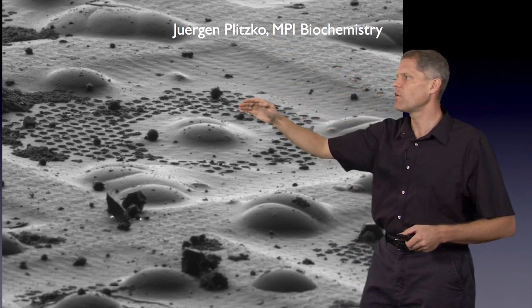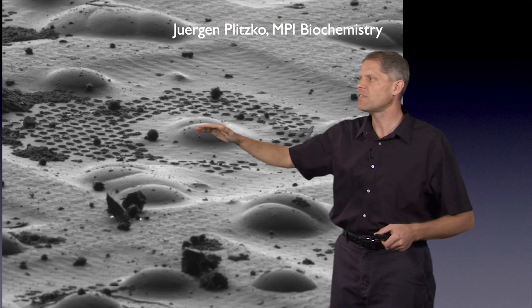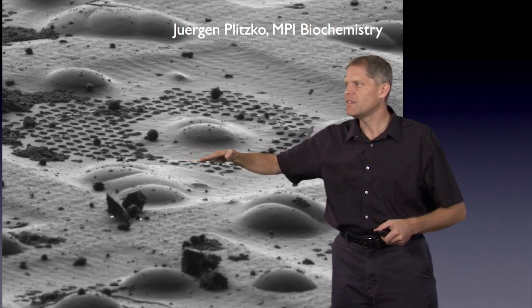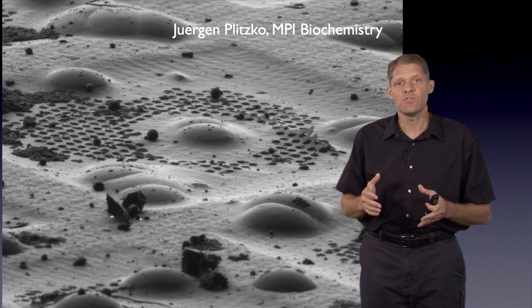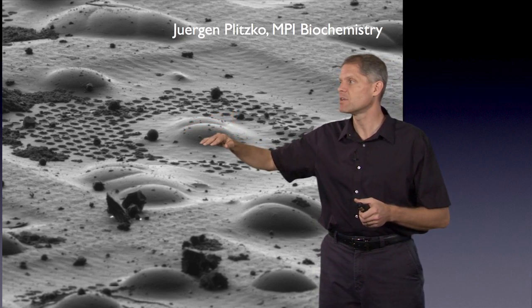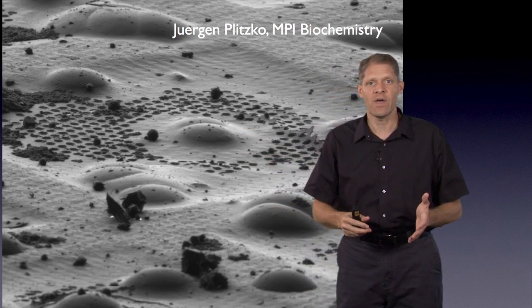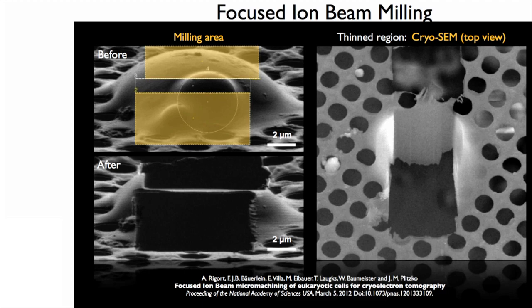And so over these quantifoil holes, a mammalian cell has grown, and the lump in the middle is the nucleus. But we can see that this cell type flattens out, so its periphery is very thin. And in these regions, it can be directly plunge frozen and imaged. But what if we want to view something inside the thicker regions of the cell that here appear as a lump? We can't do it directly because the electrons will all be scattered away if we try to image directly through that thick material. This is a figure from a paper from Alex Rigort and his colleagues that was published in PNAS, showing this process.